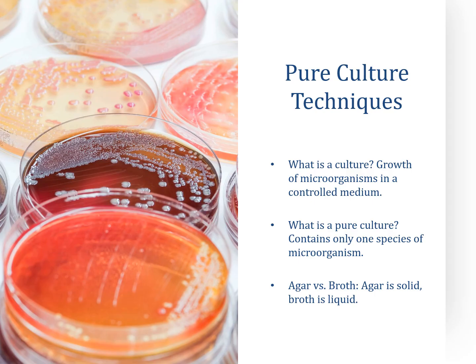The difference between agar and broth is that agar is the solid plates that we use in the lab, and then broth is liquid. So it would be in a test tube, and it usually has bacteria in it that we'd use to inoculate with.